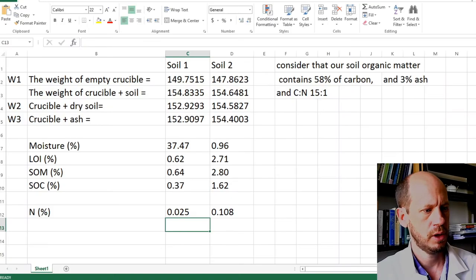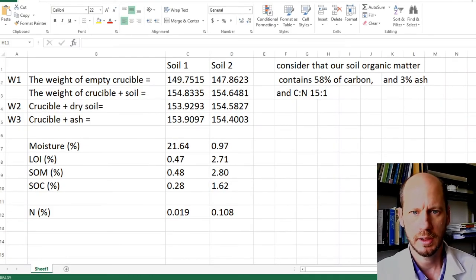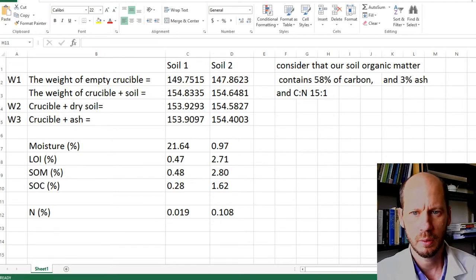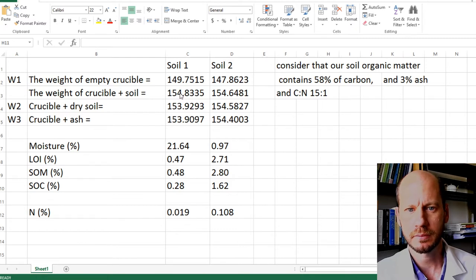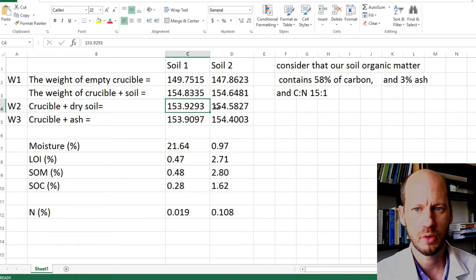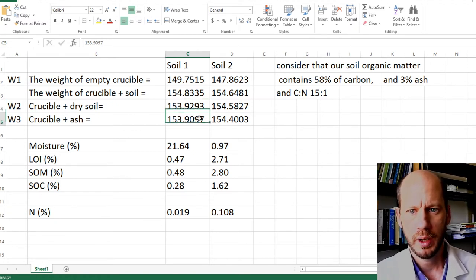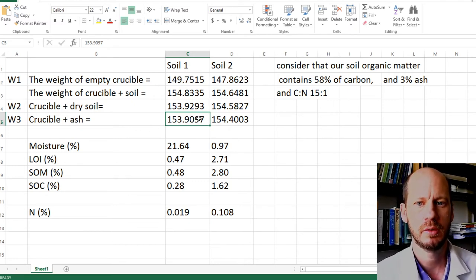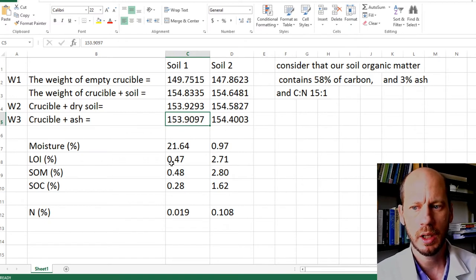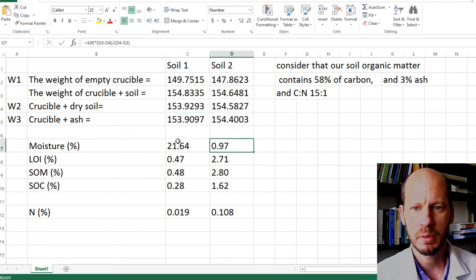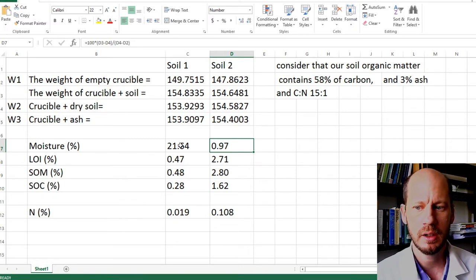Now I'm going to show you how to do the calculations in Excel. We have two soils used in this analysis: soil one and soil two. We have the weight of the crucible, the weight of the crucible plus moist soil, the weight of the crucible plus dry soil after oven drying overnight, and the weight of the crucible plus soil after burning in the furnace for three hours at 500 degrees Celsius. Moisture content in soil one was very different from soil two — soil one was very moist, soil two was very dry.